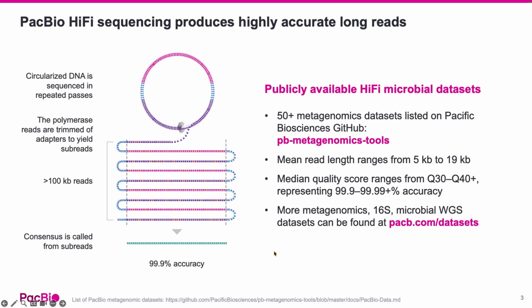And if you want to explore HiFi data and see for yourself, we do have many data sets available. These are either on our GitHub page, PB Metagenomics Tools, or pacb.com/datasets. So these are all different types of microbial genomics data sets.